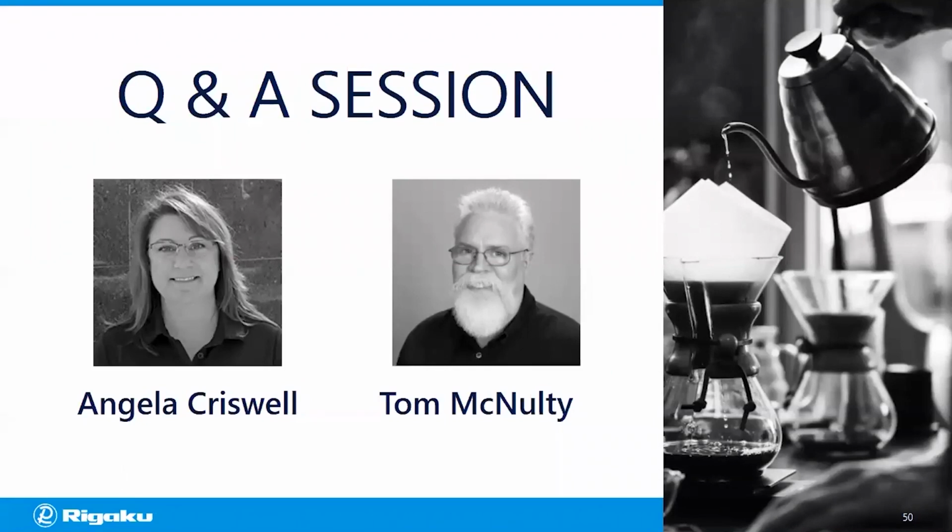Okay. Thomas asks, first a comment, says, hi, and thanks for the nice presentation. And she asked, would you be able to tell us about the estimated resolution ranges for the three instruments shown on a previous slide? Yes, I can do that. So in terms of the minimum resolvable features, the Nano 3DX is going to offer you the highest resolution. In that case, you can get to sub-micron, so 1/4 to 1/2 micron resolution.